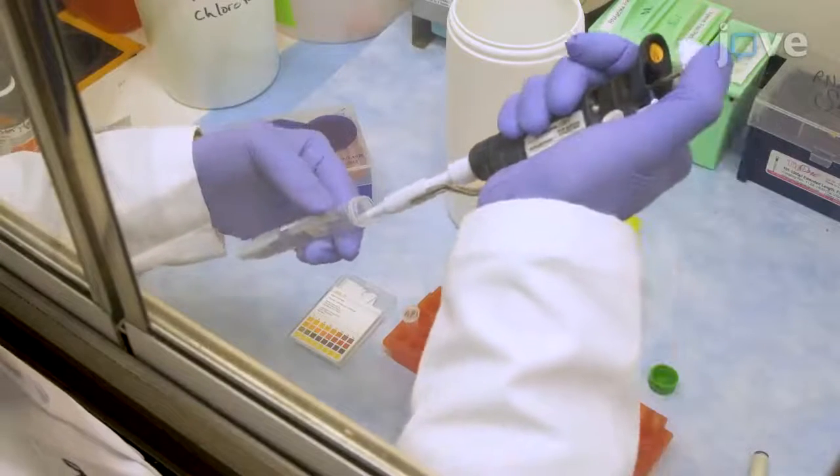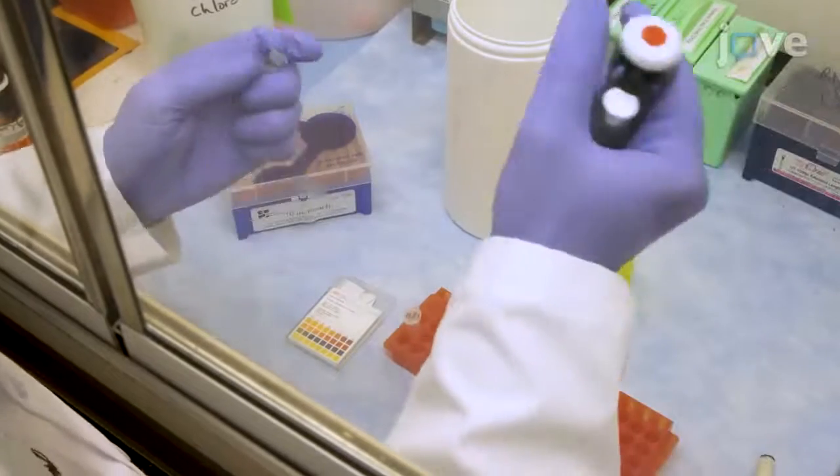Immediately before use, adjust the pH of the IDU solution to 7.5 with 12 normal hydrochloric acid.